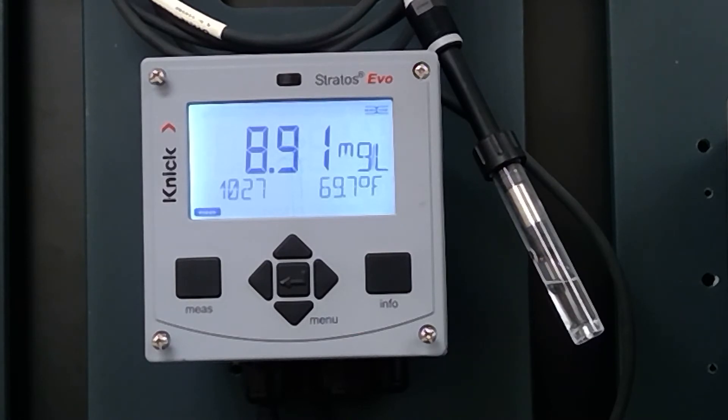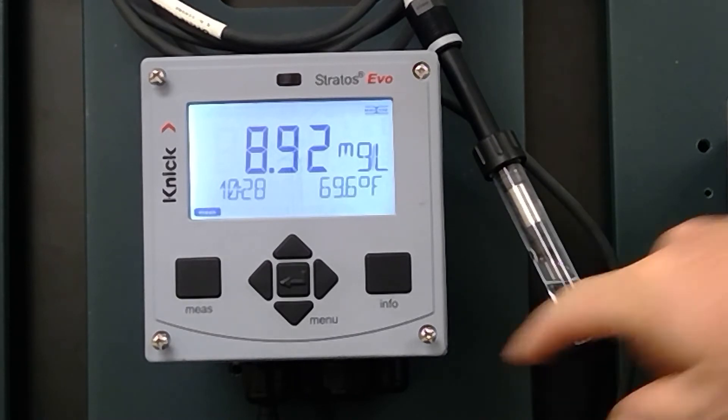Also remember you need to have the electrode connected to a power source for at least six hours so that the DO probe is stabilized and polarized. We recommend that if you're going to do PMs or calibrations, connect it to a power source — whether it be a Stratus EVO or a Portavo — and let it power up overnight. Leave it connected so the next morning when you come in you're ready to do a calibration. This ensures that when you swap it with the unit in the field, you don't get sensor drift because it was not polarized.